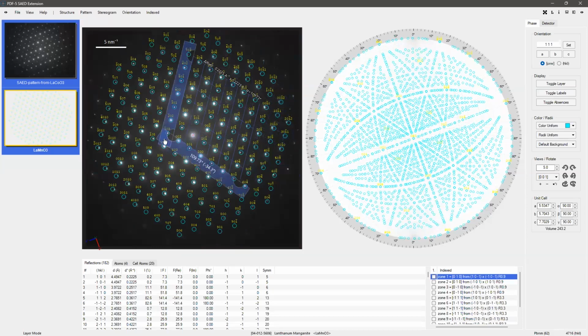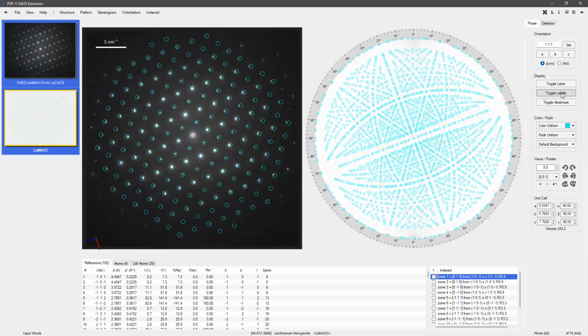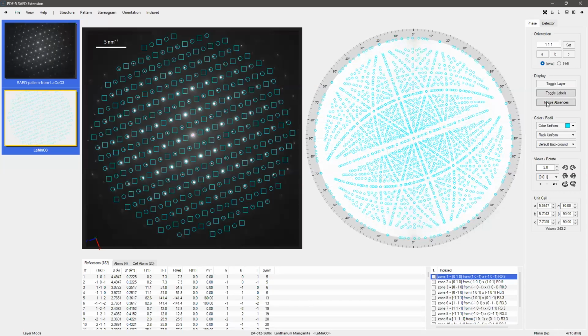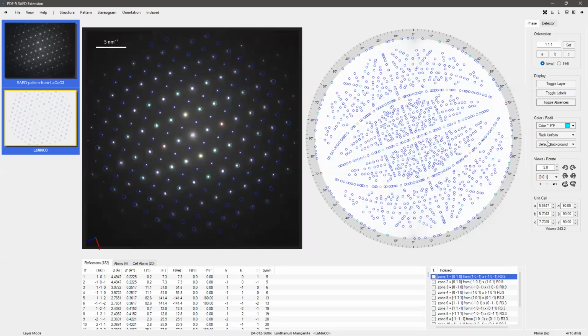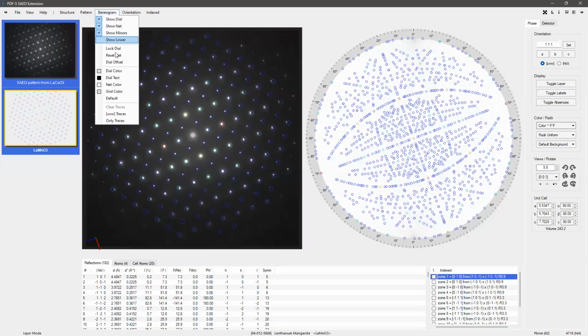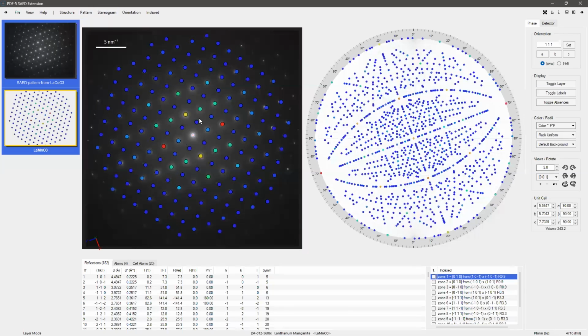With the splitter panel. Another thing you can do is, once you have this overlaid, let me disable the labels. We can show the absences also. Let's do the colors again with the normal dots, not the rings. We can also click these dots directly for other measurements.